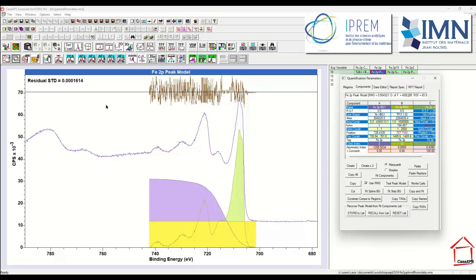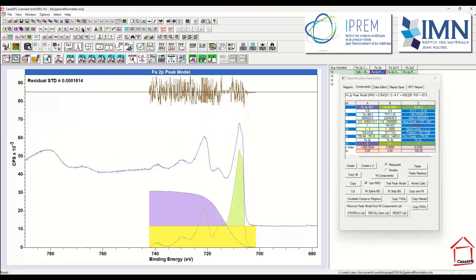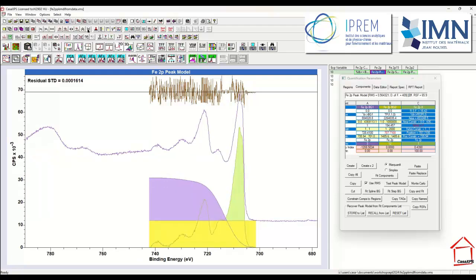Now, in addition to these options, there are additional modes for these arrow keys here. So if I simply press, then it shrinks and then it raises up the intensity in terms of the scale.